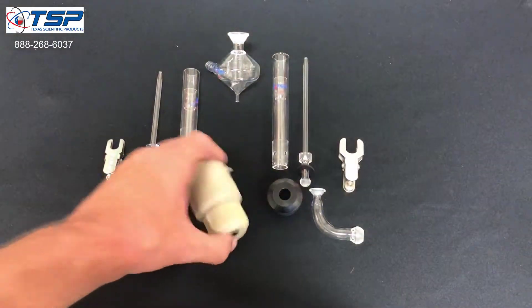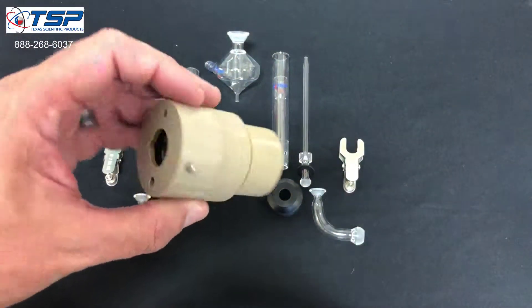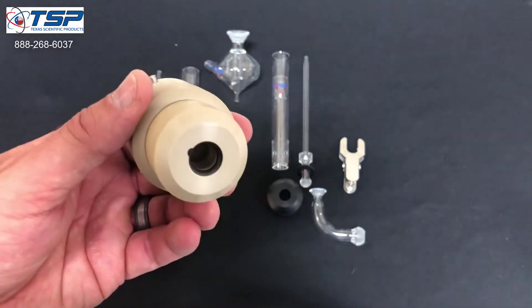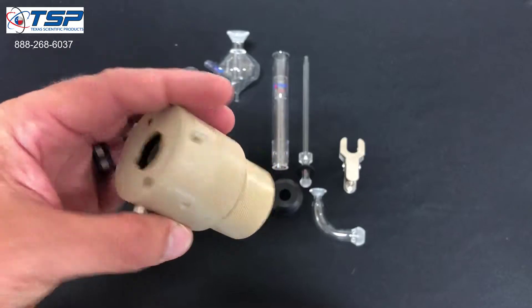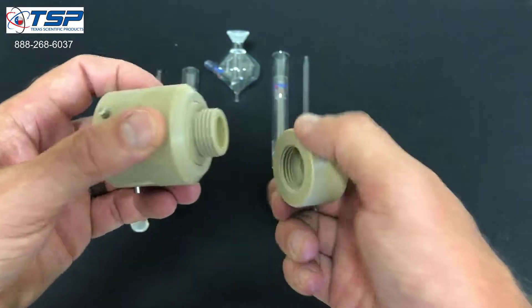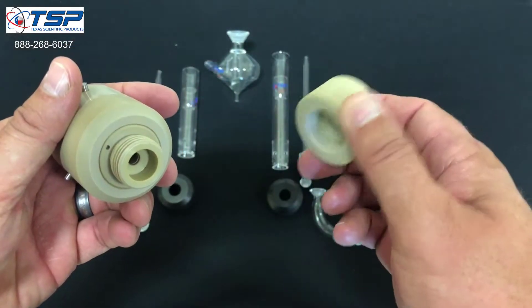The first thing that we'll take a look at is this device right here, which is supplied as a torch base with the Spectro Arcos MV. We're going to go ahead and take the nut off of that because we won't be using the nut.